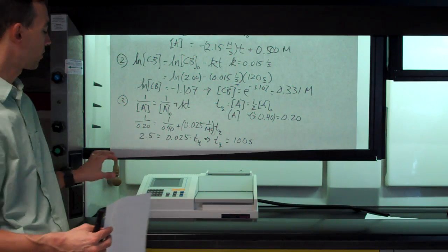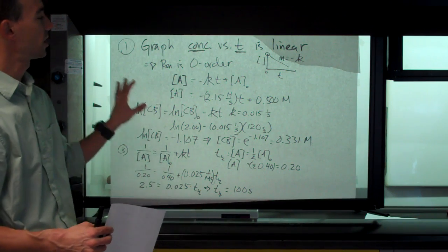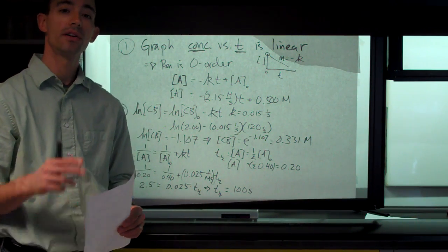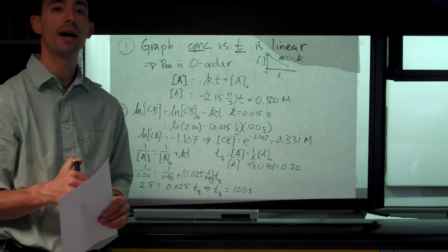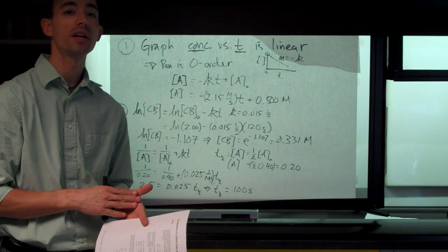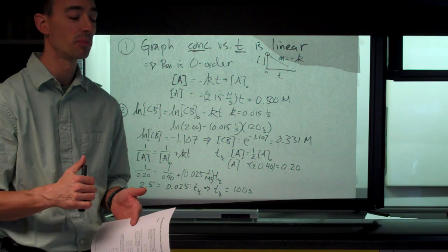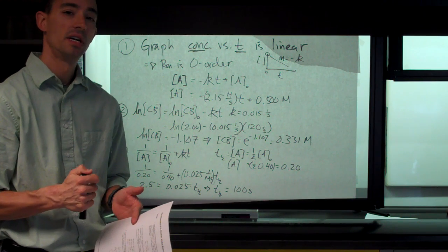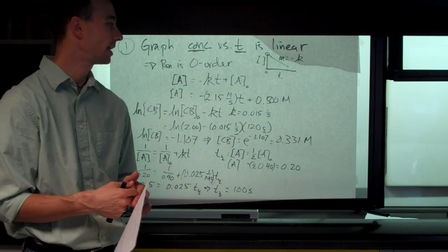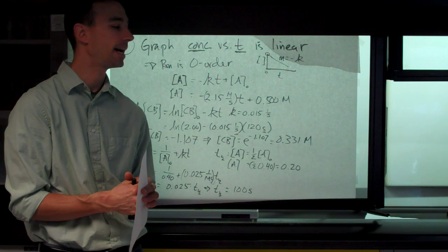Okay. So that works you through the 3 pre-lab questions. I know the description of the experiment's been a little bit briefer today than usual. There aren't too many safety concerns to worry about. The crystal violet, it will stain clothing if it gets onto it, so be careful about that because it is an intense purple color. But otherwise, you're handling base that is pretty diluted, so it's not too concentrated and shouldn't cause any sort of problem for you during the lab today.